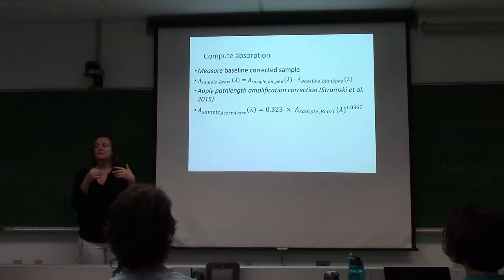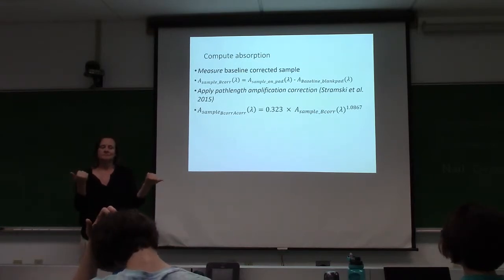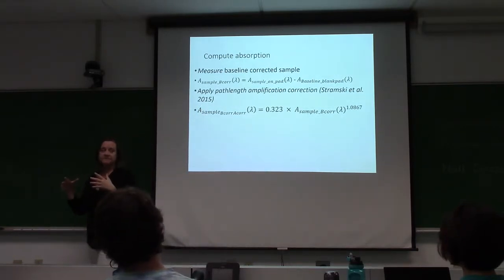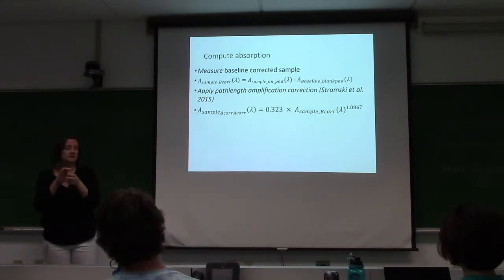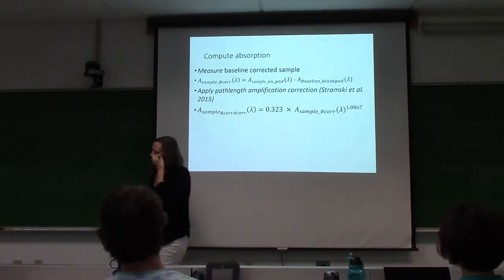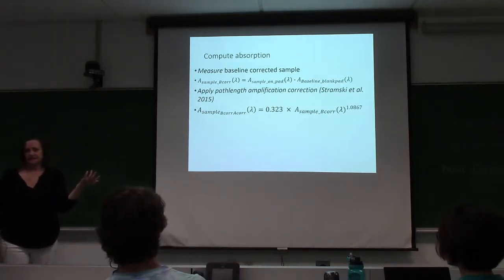And so cultures make the best source. Darius concentrated some natural samples and then put those in a 1 centimeter cuvette to do this correction factor. And there's some variability, but it all lies along this pretty nice equation. I've done it for a number of different cultures just to verify that it looks the same, and it does.